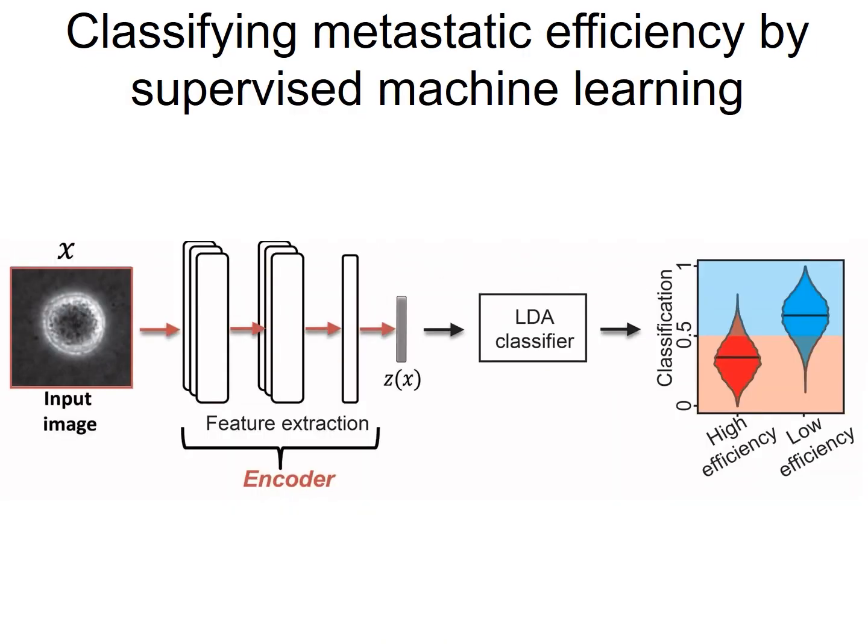Next, using the autoencoder learned cell representations, we trained a classifier to discriminate between high and low metastatic efficiency tumors and validated the classifier predictions on new melanoma cell lines in mouse xenografts. The power of deep learning to recognize meaningful patterns that escape the human eye is also its biggest weakness: interpretability. What are the physical properties that discriminate high from low metastatic efficient cells?